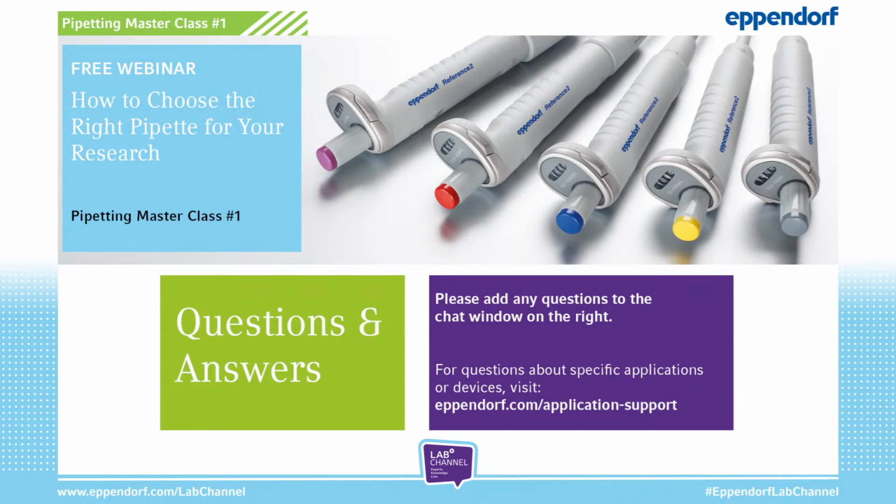Yeah, thanks for that. Maybe just as an addition, we also have a user guide regarding the topic of calibration and adjustment of your pipetting systems. Just go to the Eppendorf website and look for user guide number 25. That's user guide number 25.